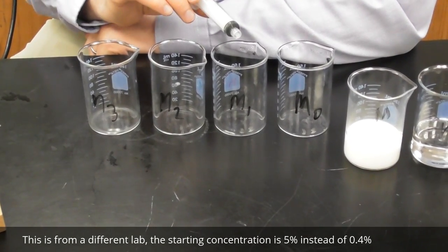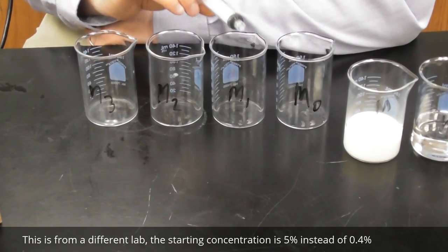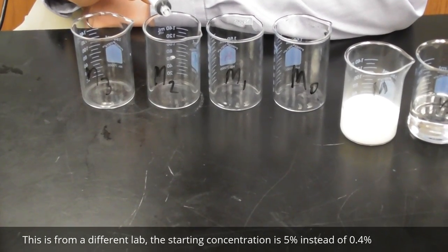Then I would mix that. And then I would take that 2.5% and I would take half of that and I would take that out and put that into here.